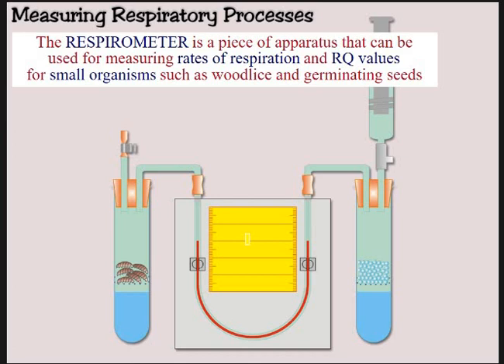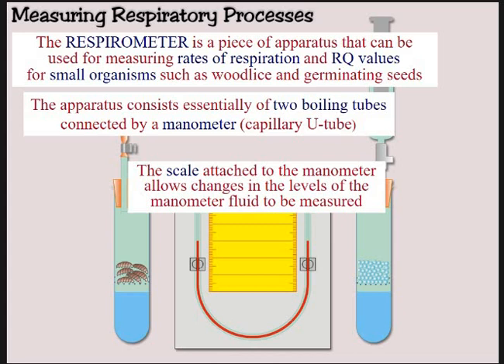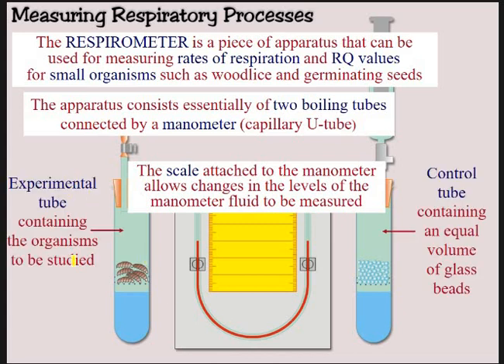This is designed for small organisms such as woodlice or germinating peas. You have this U-bend piece of glass called a manometer, with some capillary tubing. It's got a scale on it, allowing you to measure the changes or movement of the fluid over time so you can work out a rate. We've got our experimental tube on one side and our control tube on the other. The control tube contains glass beads.